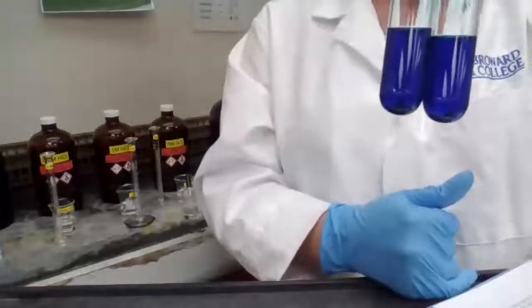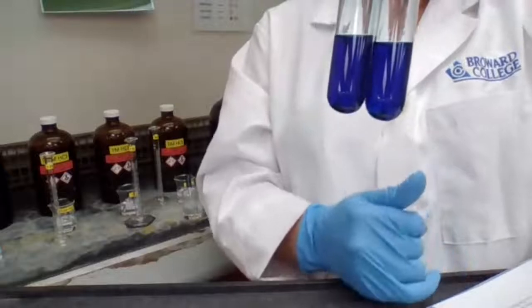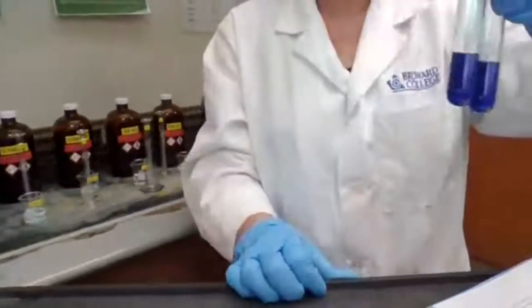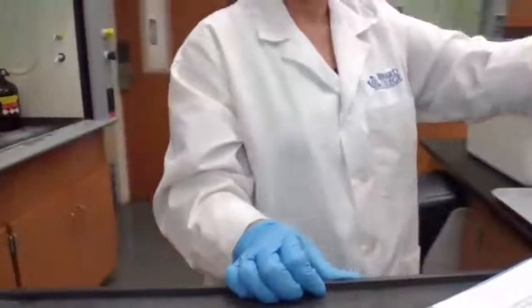Now, I'm going to take one of the test tubes only. I'm leaving one test tube in the test tube rack. To the other test tube, we are going to add deionized water.